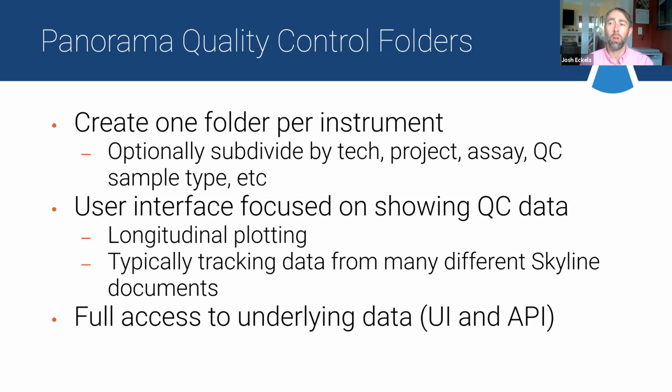Of course, we may want to be able to compare across instruments later to really calibrate everything across all of our data sets. But for system suitability, we focus on one instrument at a time. And then have a user interface within Panorama that's explicitly devoted to this approach.